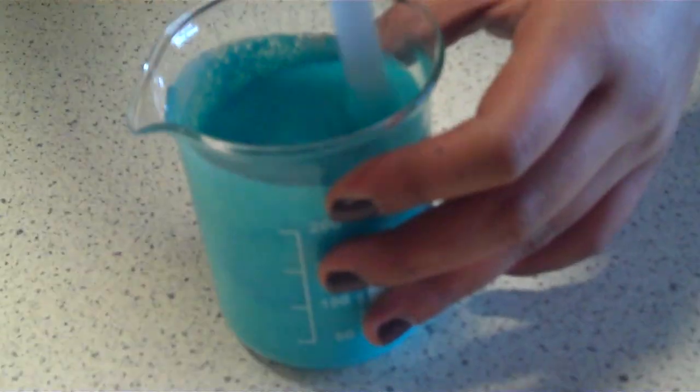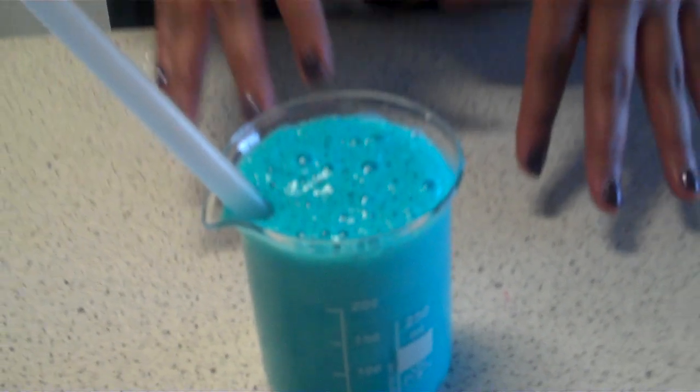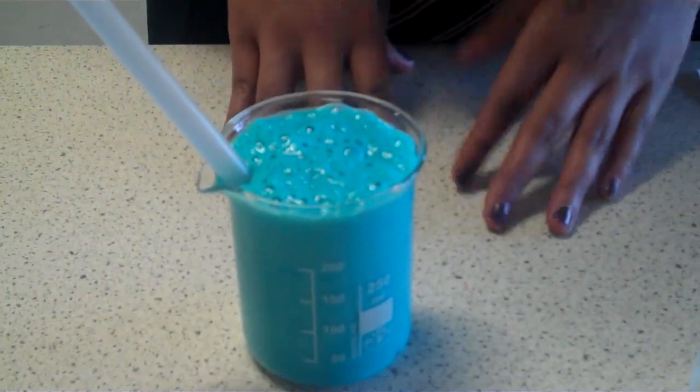As you can see, a reaction is taking place and carbon dioxide is being formed. Once this finishes reacting, you have to leave it in a fridge for about two days so the temperature has got to be about 5 to 10 degrees, and once it's cooled off it will become a sort of powder and you put it through the filter.